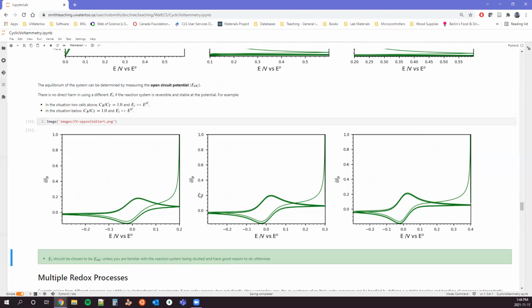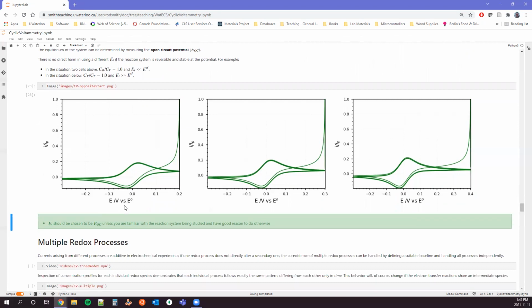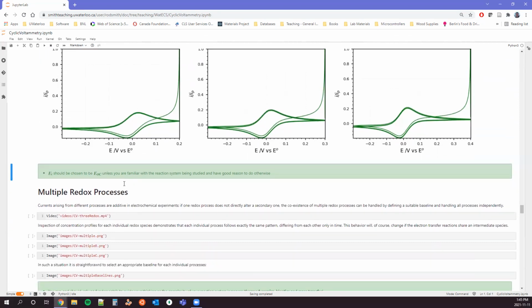If you think back to that video we saw, that's because we're working on a diffusion gradient that we formed near the surface, right? And so we can still see the characteristic behavior of the system if we're lucky. But it comes down to understanding exactly what's happening in your system, and no two systems are going to behave identically. So before you become familiar with your system, definitely set your initial voltage to the open circuit potential, and then you can play around afterwards and probe the system and maybe learn something new.